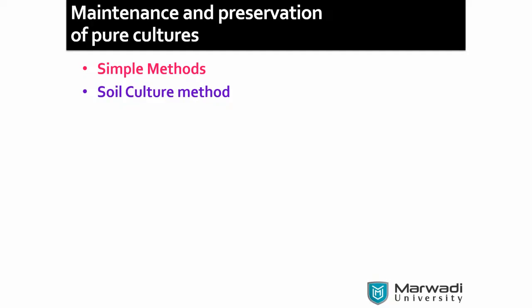Fine. Till this, anybody having any questions? Just culturing, subculturing, and the oil layering. Simple method. Yeah, so incubate it directly.